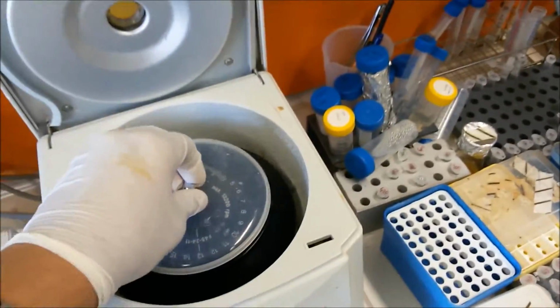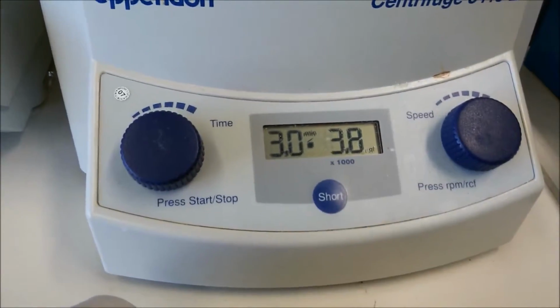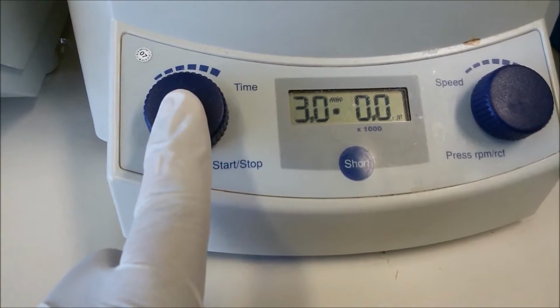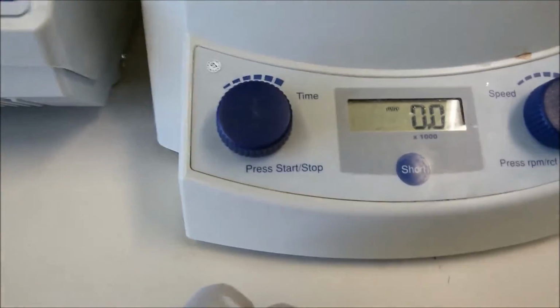We will close this and we will have a look at the setting. So you can look at the display here. The display tells you press to start or stop, so you can press it. If you press it, it will start. See, you can press again, it will stop.